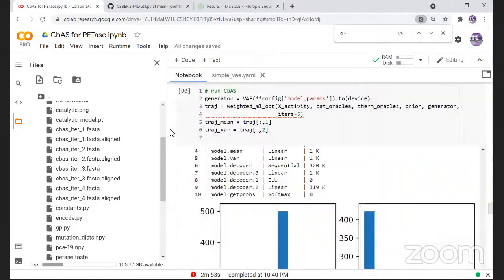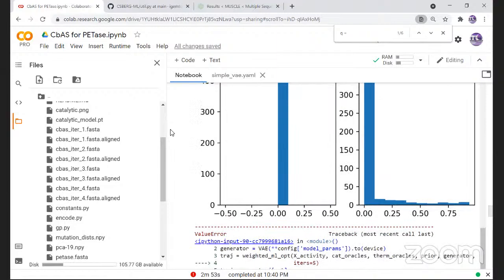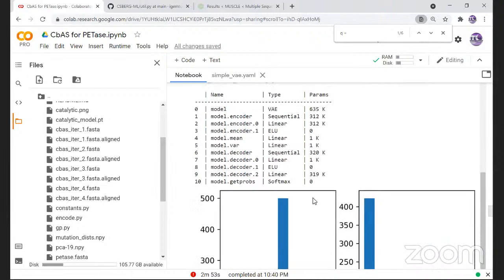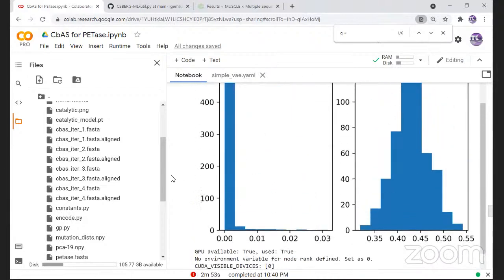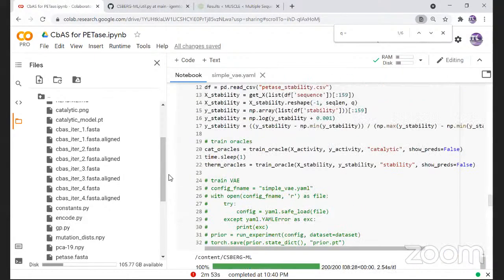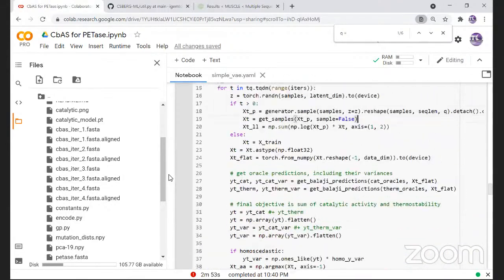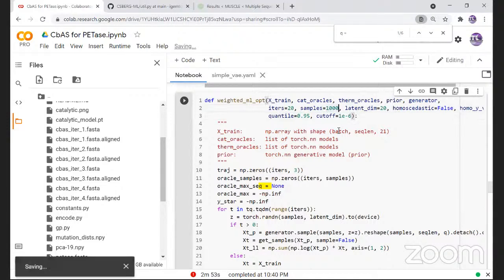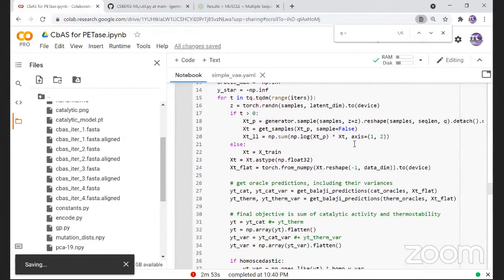Clearly something wrong. That's non-trivial. Right, so this thing is disappearing again. So I tried a bunch of stuff and none of them seem to work. So we're going to revert back to, I guess, at least what seems like was the thing that did work.